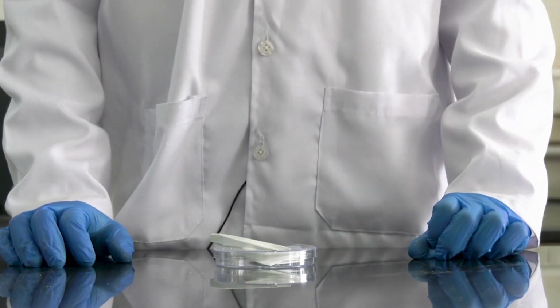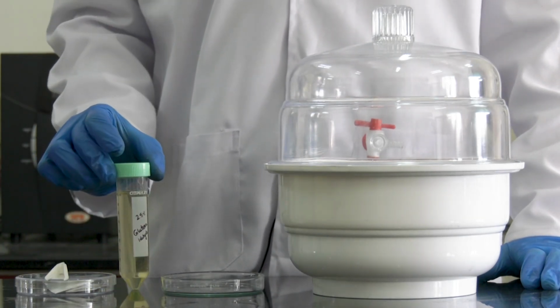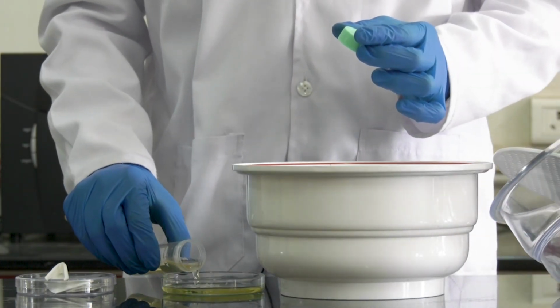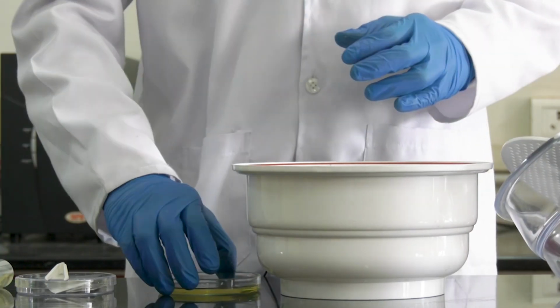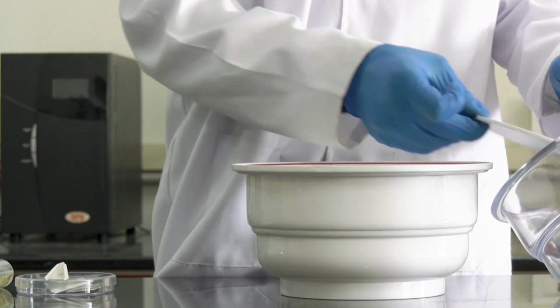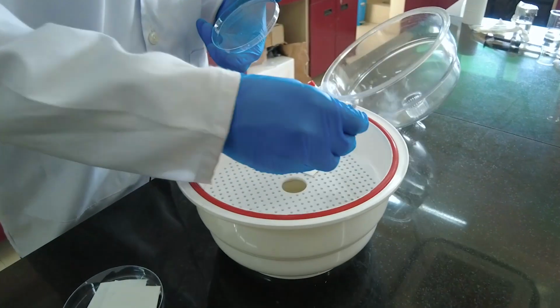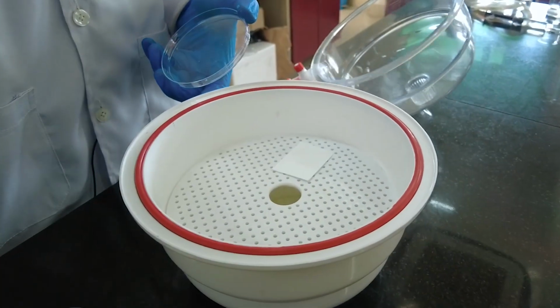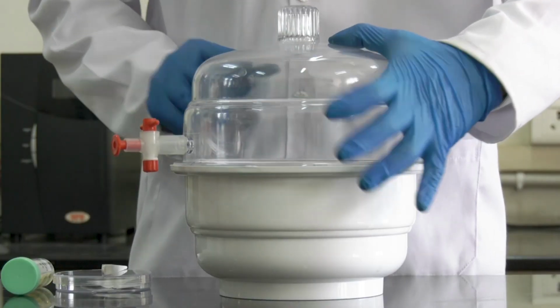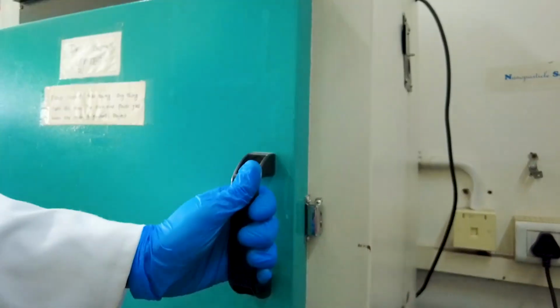Now we will perform the cross-linking step. We will cross-link the nanofibers using a 2.5% glutaraldehyde solution. Pour the glutaraldehyde solution into a petri dish and place it at the bottom of the desiccator. Place the nanofiber mat in the desiccator and heat it at 37 degrees Celsius for 15 minutes in a hot air oven.